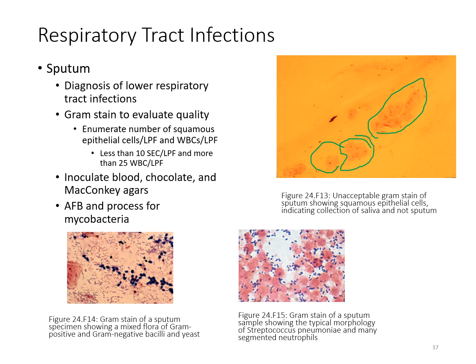Here we have some gram stains that include, at the bottom here, our gram stain of our sputum that shows some mixed flora. So you have some gram positive, gram negative, as well as some of these larger cells here, which are yeast.